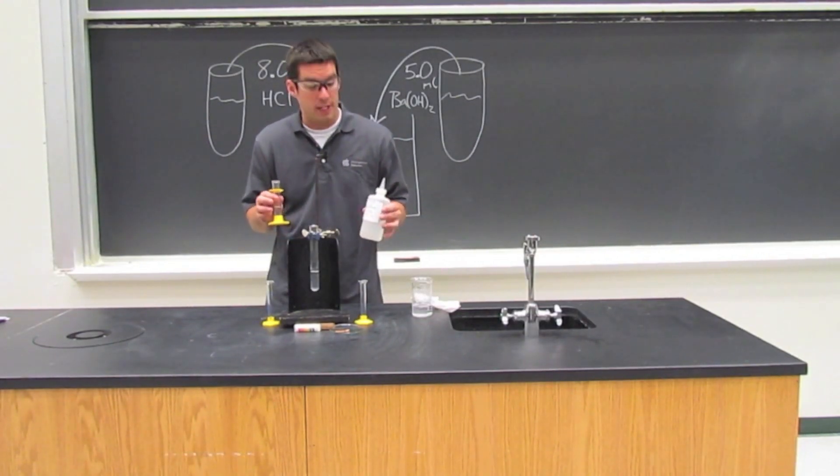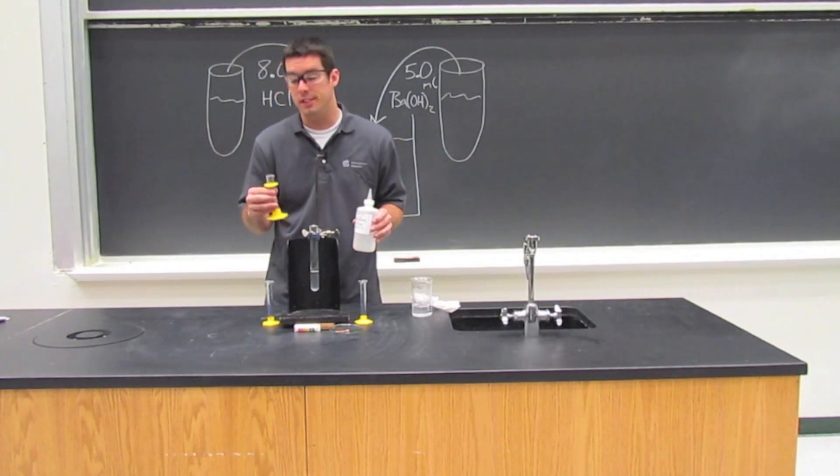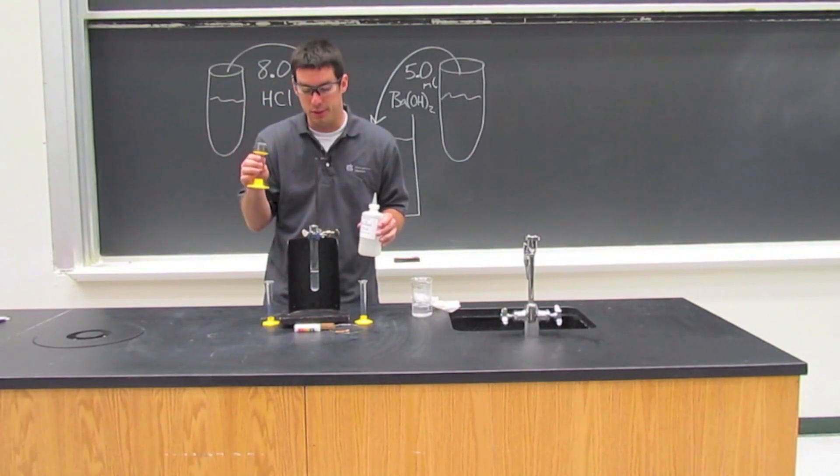Now in the next step, we're going to add 0.1 molar zinc nitrate to the same solution. I'm going to add 12.0 milliliters of the solution.